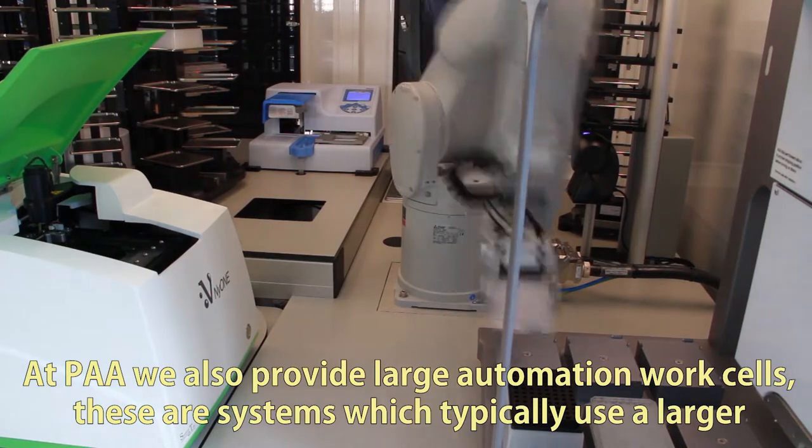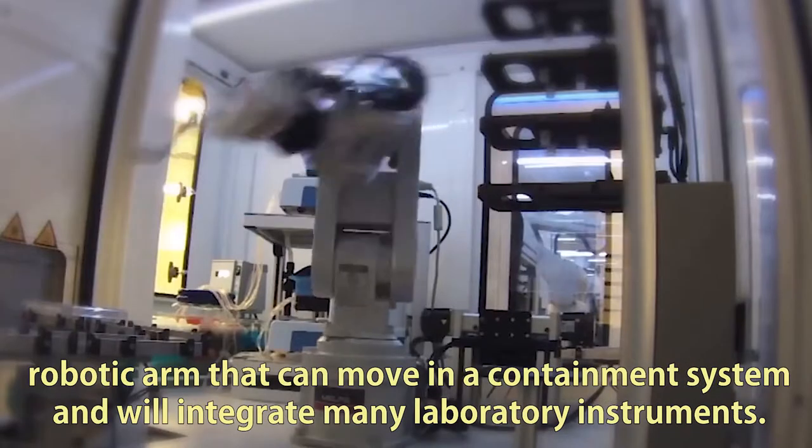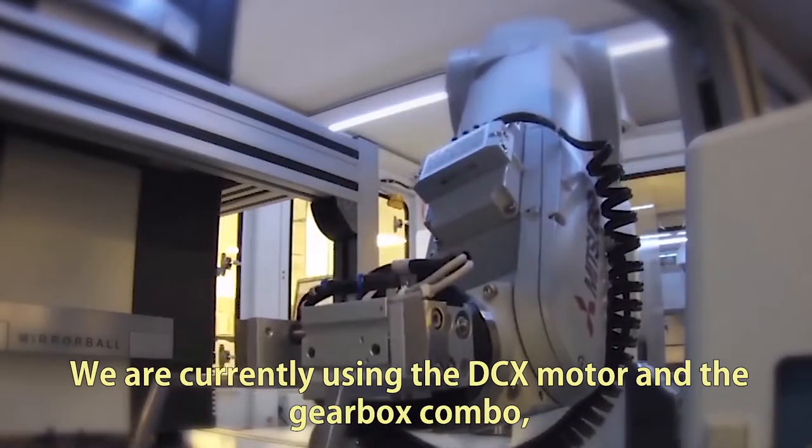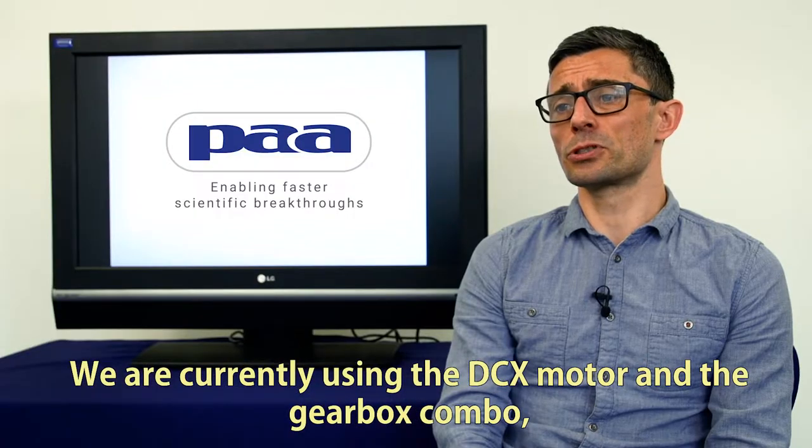At PAA, we also provide large automation work cells. These are systems which typically use a larger robotic arm that can move in a containment system and will integrate many laboratory instruments. We're currently using the DCX motor and the gearbox combo.